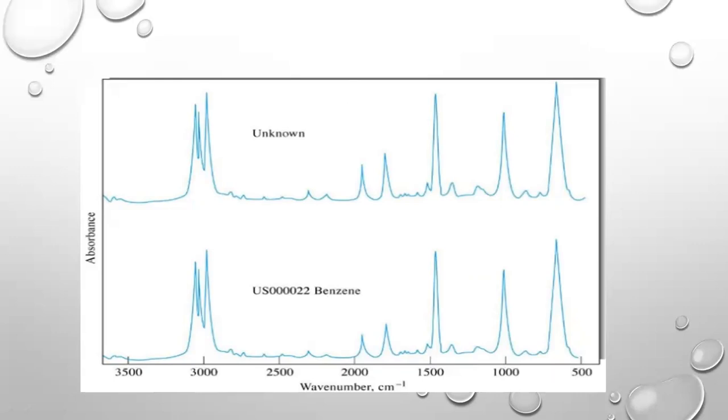After the scanning, the software will produce the result that there is 90% or 100% matching between the library spectrum and the scanned spectrum. If it is more than 70%, then we can be sure that the scanned compound is similar to the library result.